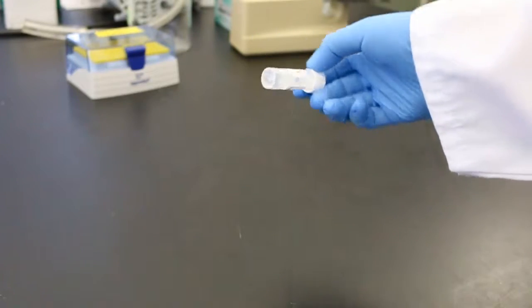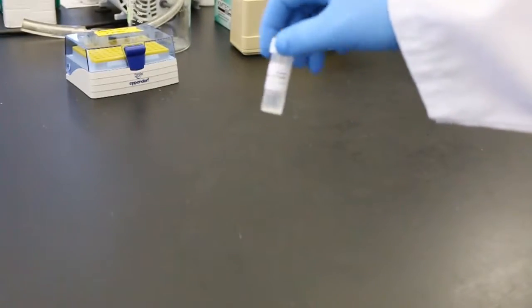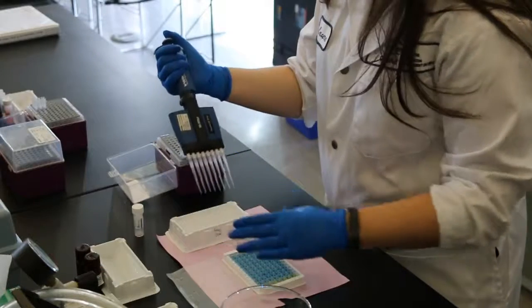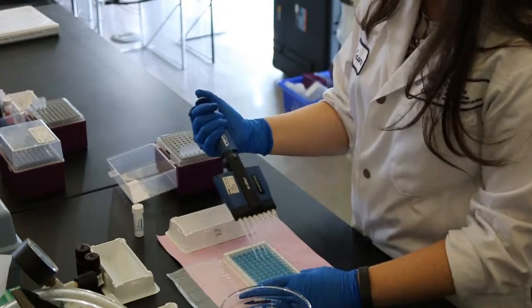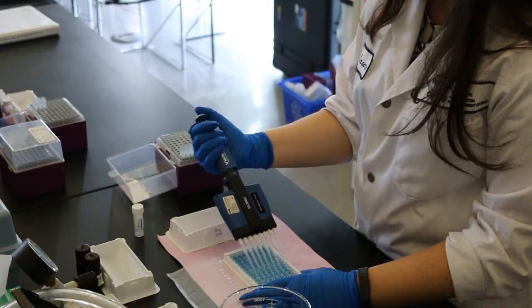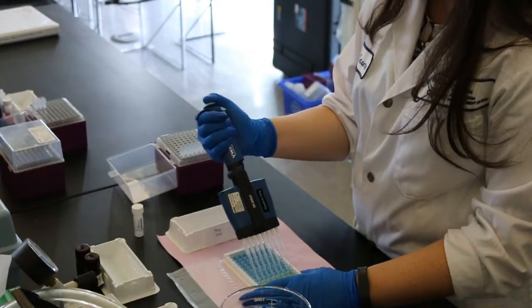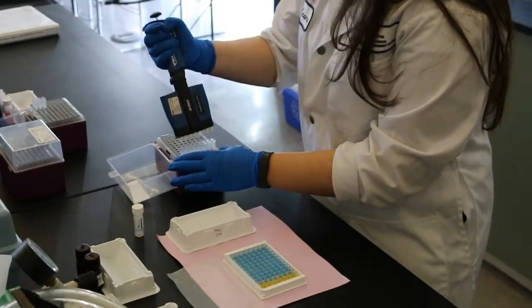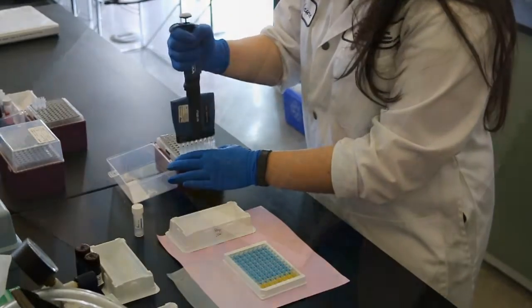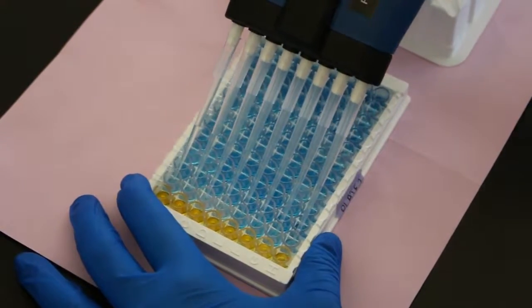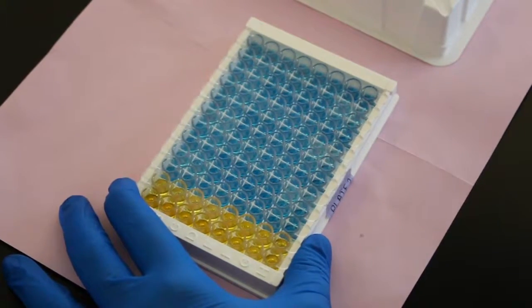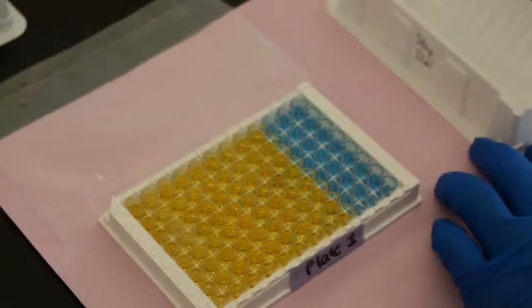The stop solution is inverted several times and poured into a clean tray. 50 microliters of stop solution is added to all of the wells using a multi-channel pipette. Upon addition, the stop solution will tint the wells yellow. The samples containing higher levels of toxins will again appear clear, and the samples with the lower levels of toxins will be tinted a brighter yellow.